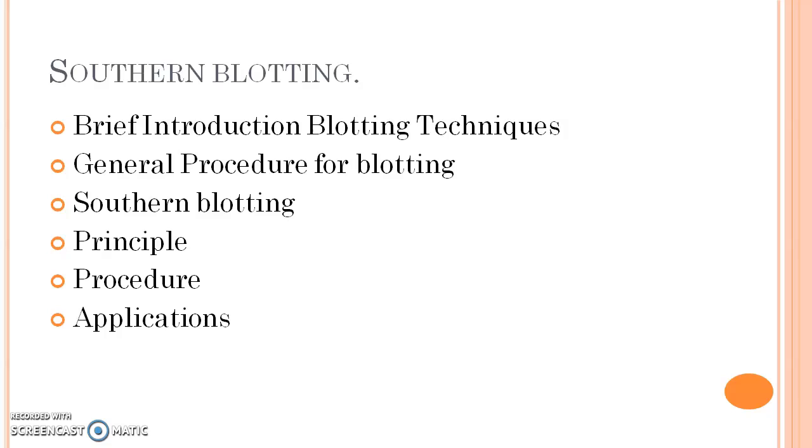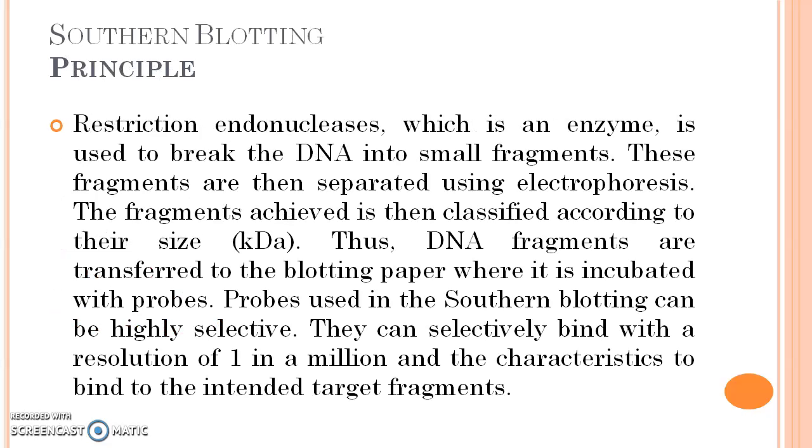Already we had covered the details associated with the blotting techniques, the general procedure for blotting, what is Southern blotting, what is its principle involved, and in this video we will go through the detailed procedure for Southern blotting and its applications. Once more we will go through the principle in case of Southern blotting.